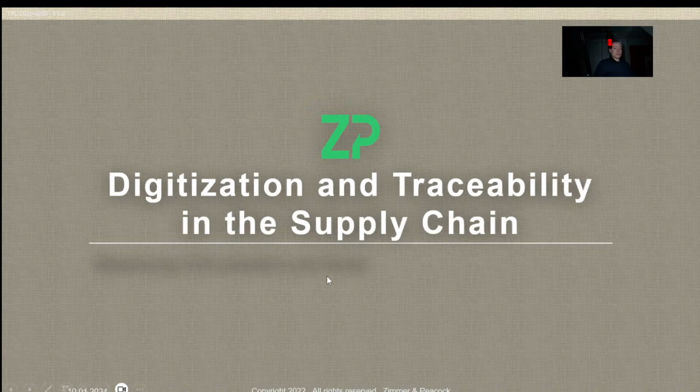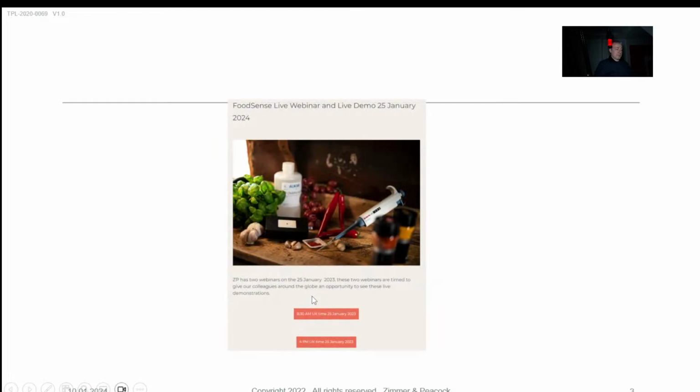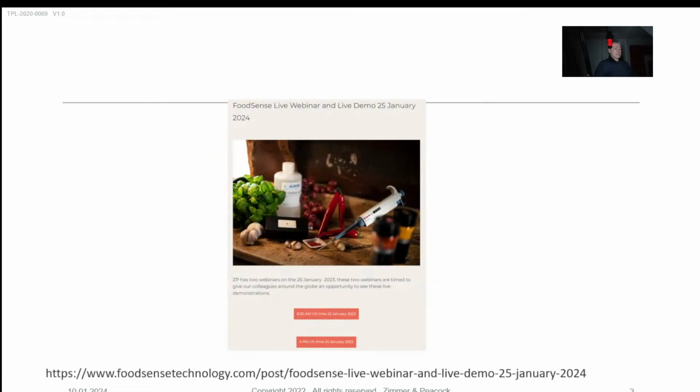But you'll see that transparency come up today as well, because it means that we can actually confirm why the app says what it says. So today I'm going to talk about measuring chili powders and foods. Every week we do this webinar as part of the support. Every month we do a live streaming webinar, and that's also part of the support. We just like to have this constant, once a month people can expect to see a live webinar.